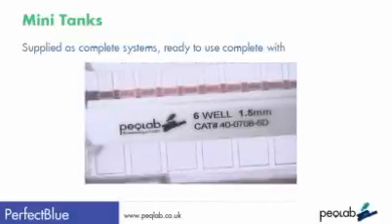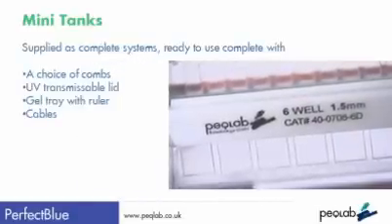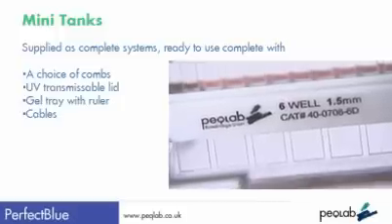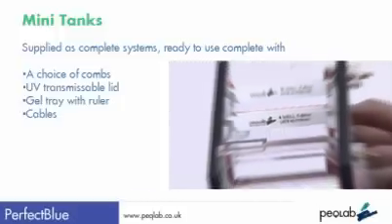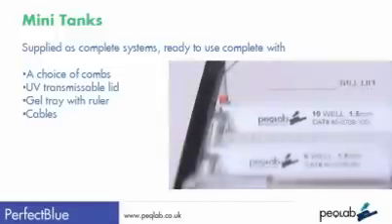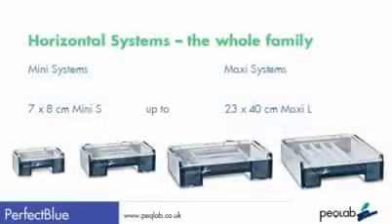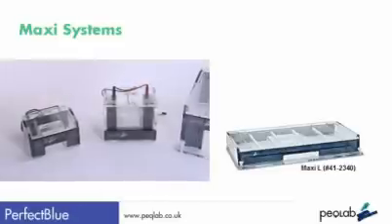The Perfect Blue mini systems are supplied as a ready-to-use package, with a choice of combs including micro-titer combs, cables, lid, tray, and tank. A very nice final feature is the clear labelling of each comb. Mini tanks are available in small, medium and large, plus extra-wide systems, ideally suited for micro-titer combs and genotyping.